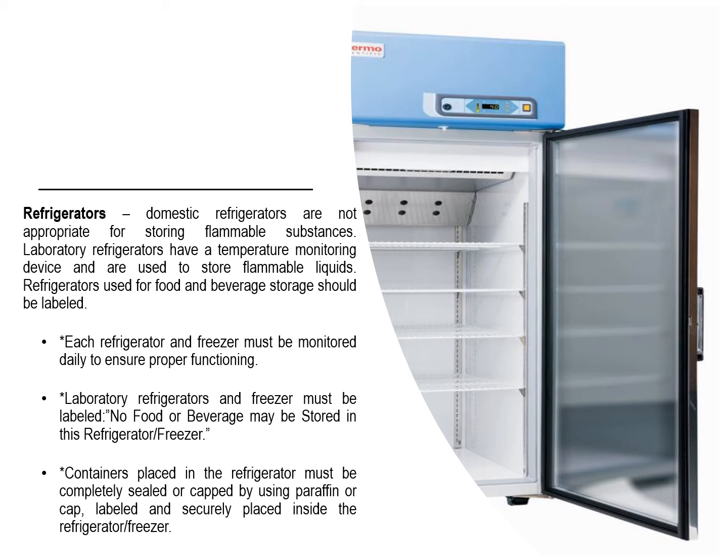Then, containers placed in the refrigerator must also be completely sealed or capped by using paraffin or a cap, labeled, and securely placed inside the refrigerator or freezer. So, to avoid spilling of solutions placed inside certain containers, you have to cover them properly or seal them properly.